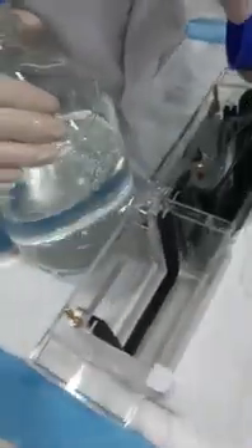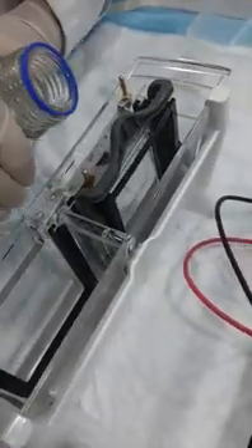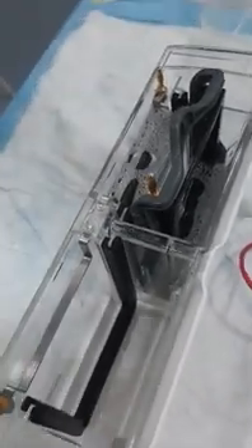For the outside chamber, just pour halfway. There's no need to top up all the way to the top, but if you do top up all the way that's also fine.